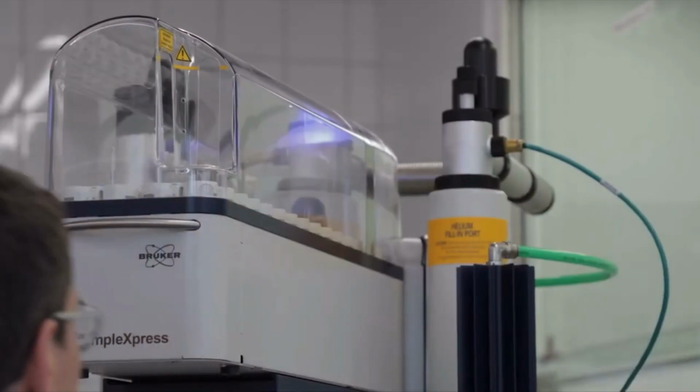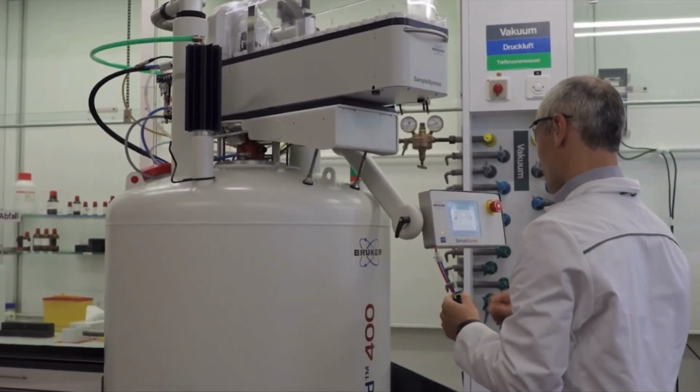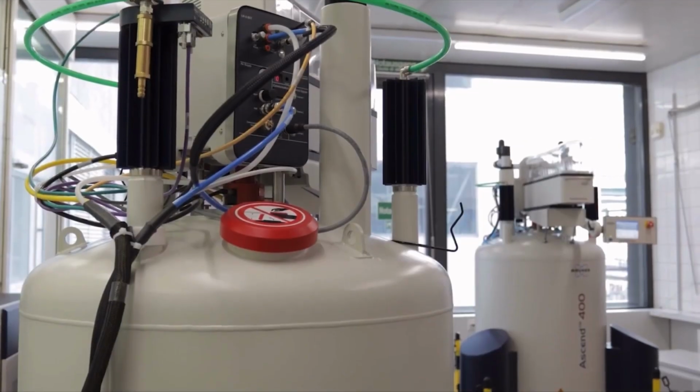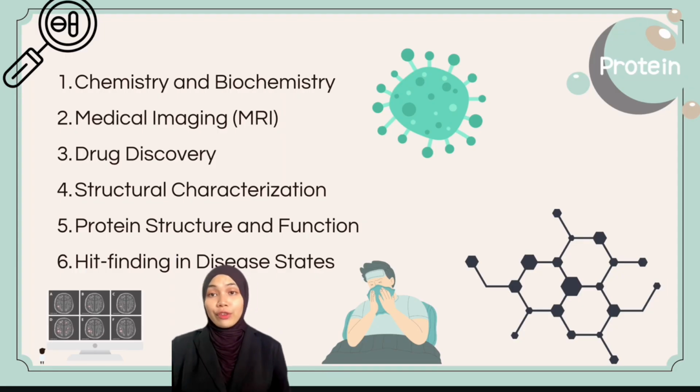imaging. In drug discovery, NMR spectroscopy plays a crucial role, facilitating trials of cancer therapies, optimizing nutritional supplements, and providing information on molecular interactions. It is also a powerful technique for the characterization of small molecules and determination of their structures. In the fields of biochemistry and biophysics, NMR spectroscopy is used to unravel protein structures, analyze amino acid profiles, and study molecular mobility, contributing significantly to advancement in understanding biological processes.